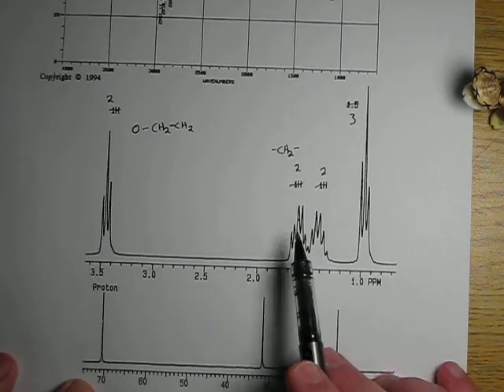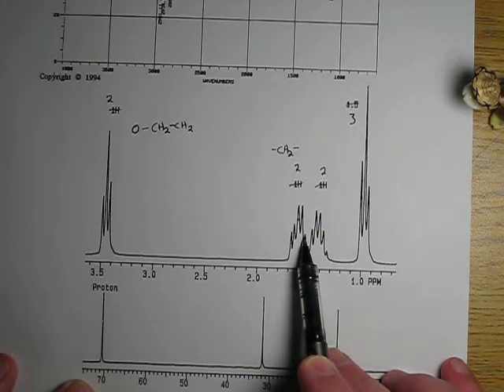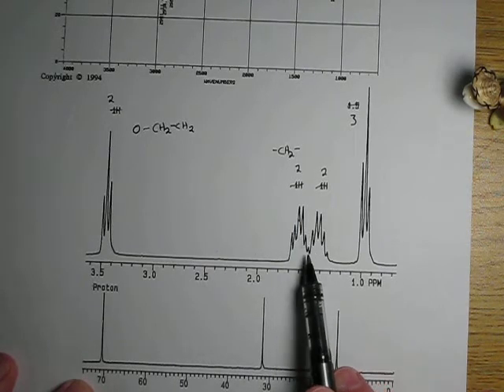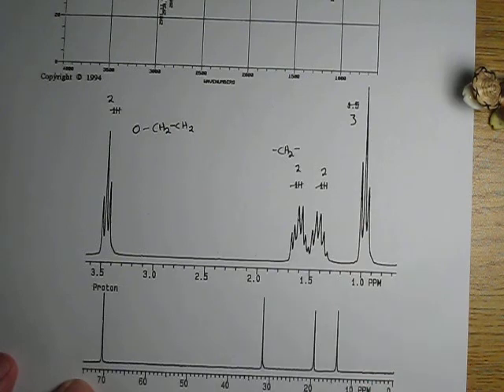So what are the possibilities? Well, 1, 2, 3, 4, 5. 5 peaks, which means this guy sees 4. Well, that'd be a CH2 and a CH2. Or 1, 2, 3, 4, 5, 6 peaks, and this guy sees 5. That would be a CH2 and a CH3.